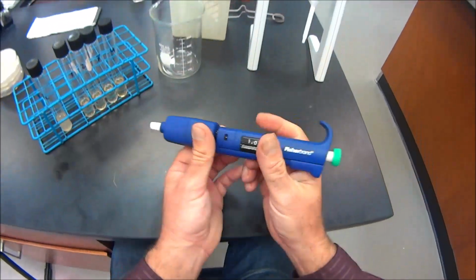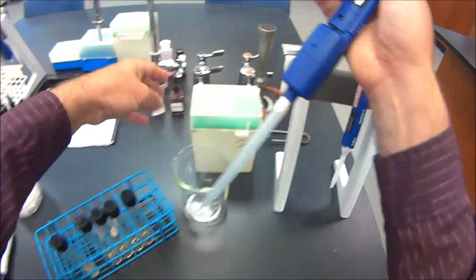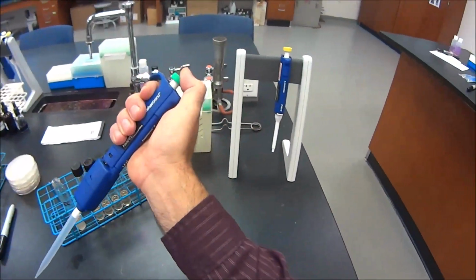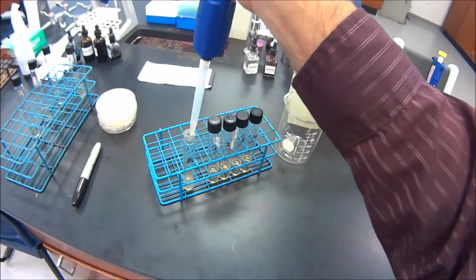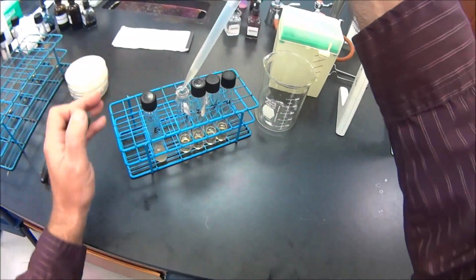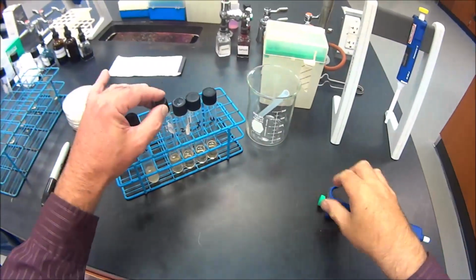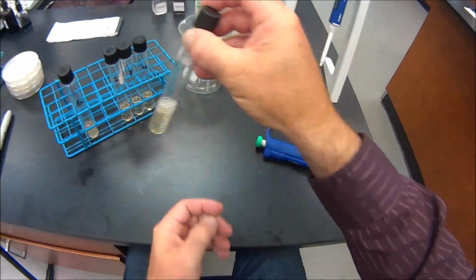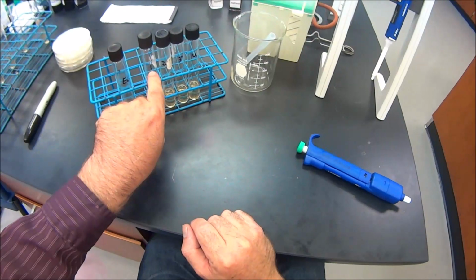And, okay, put a new sterile tip on. Sample from the E. coli. Press down on the green button. Reach down in here. Suck up 1 milliliter. Now add that 1 milliliter to tube number 1 and dispose of the tip. Now I'm going to take tube number 1 and shake it. Okay, so now that is a 10 to the minus 1 dilution.